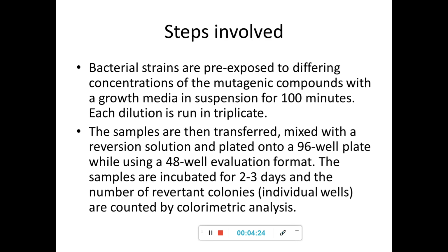After that, the samples are incubated for 2 to 3 days, and the number of revertants are checked by a colorimetric analysis.